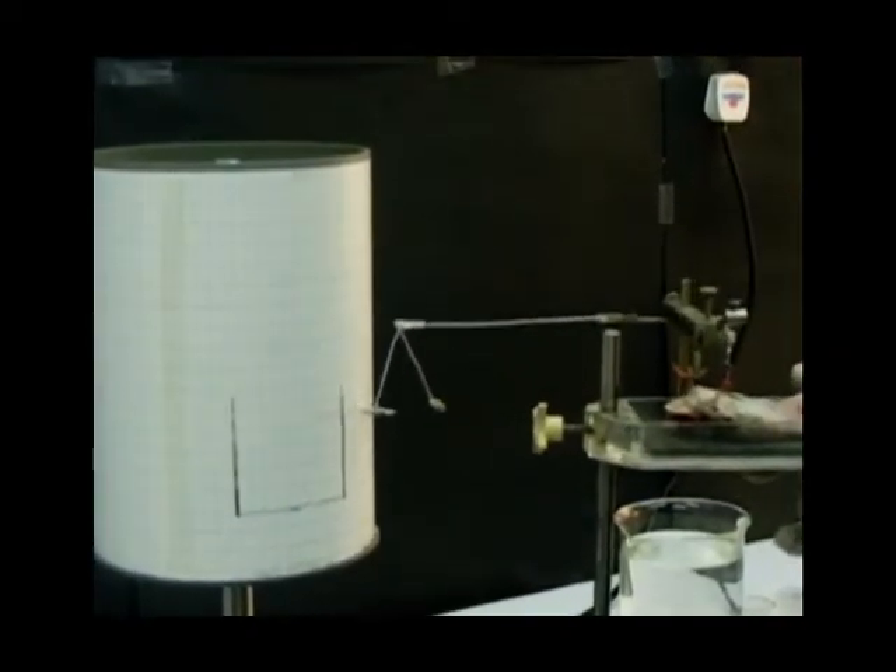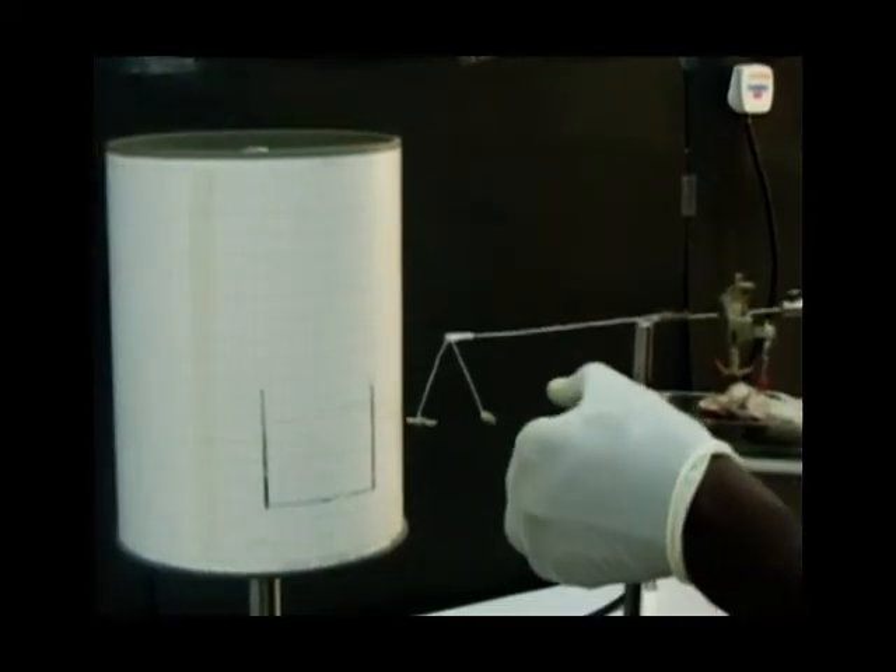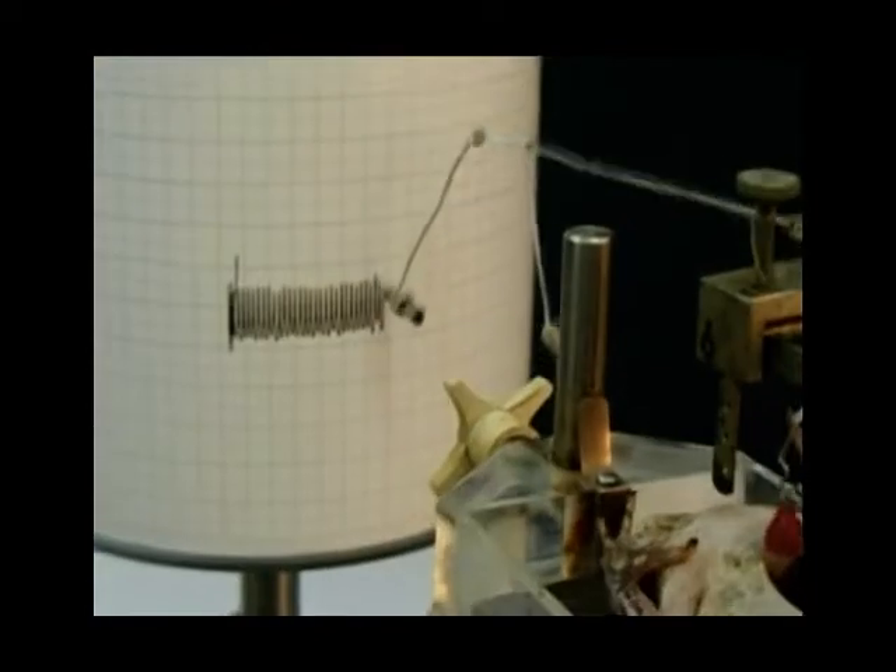The contractions of the heart give rise to a regular waveform which is recorded on the chart recorder.